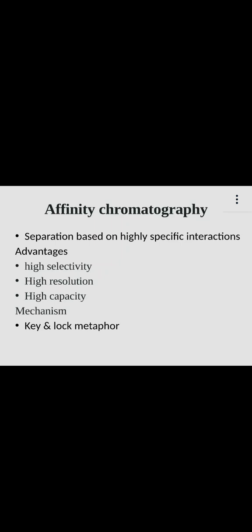What are the advantages of affinity chromatography? One of them is that it has very high selectivity. So any molecule that is not interacting with the stationary phase will not be retained and therefore is easily removed. And because of that high selectivity, resolution is also very high.